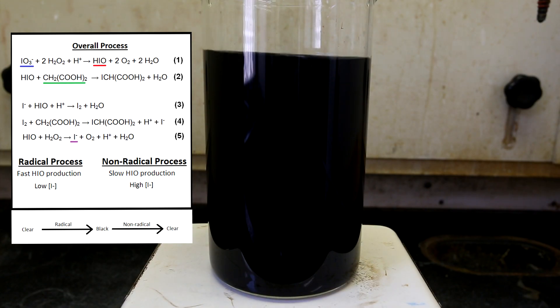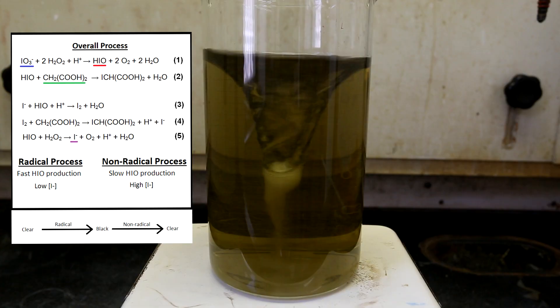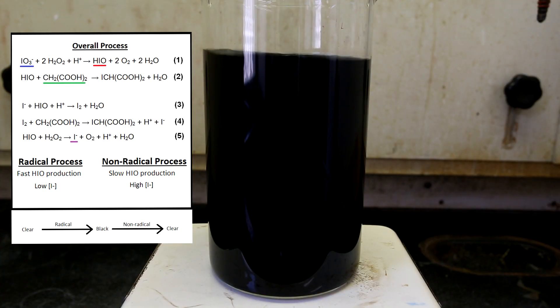As mentioned before, the radical process produces hypoiodous acid very quickly, and it will produce it much quicker than it can react with a malonic acid. This rapid rate of production of hypoiodous acid leads to an excess of it in solution. The excess hypoiodous acid then reacts with hydrogen peroxide to form the iodide ion as shown in equation 5, underlined in purple. Then, as shown in equation 3, this iodide ion will react with hypoiodous acid to produce iodine. In solution, iodine has a yellow color, so as its concentration builds up, the solution becomes darker and darker yellow.